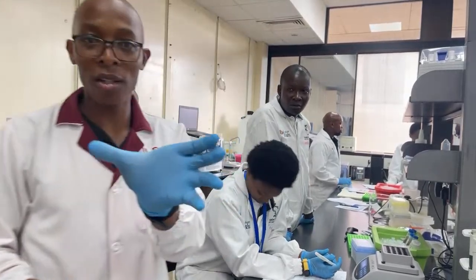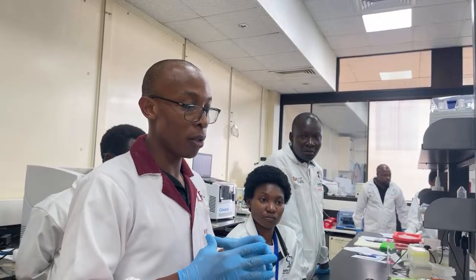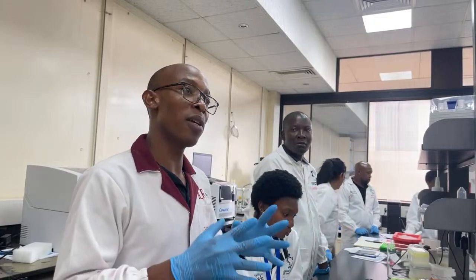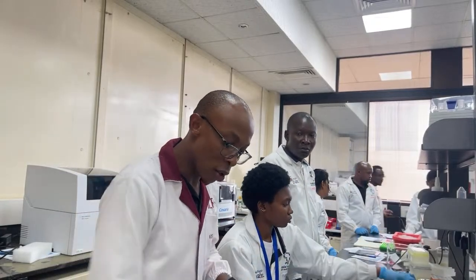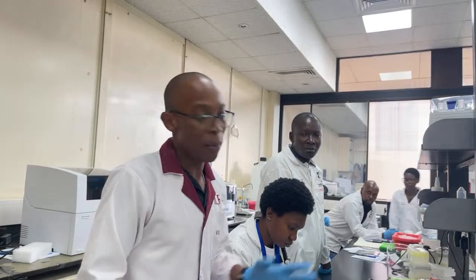So I'll zoom in on the disc so that they can see the microscopic view of the disc. It's basically just the silica coated on the disc, whatever magnetic disc they're using. There are no holes here. It's just the silica structure randomly placed, coated on the magnetic bead, so that the DNA can move within the channels while wrapping itself around all those hooks. But whether it's the same material, I don't know. Oh, okay. Thanks.